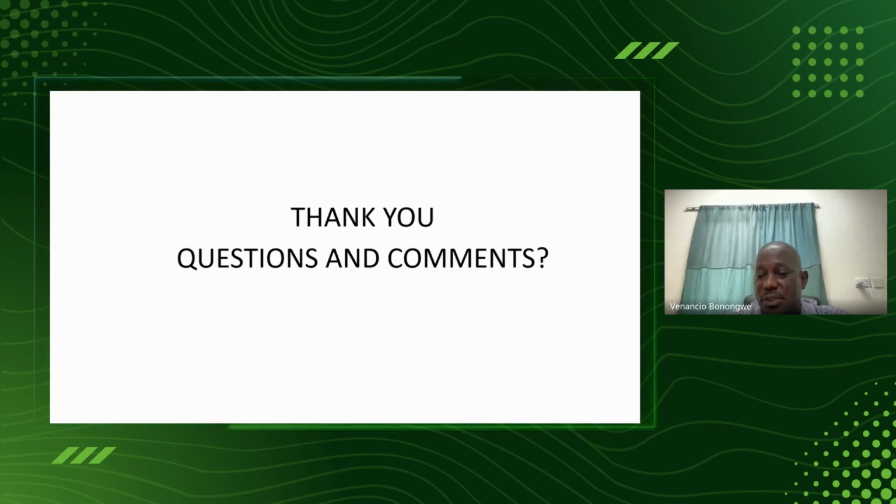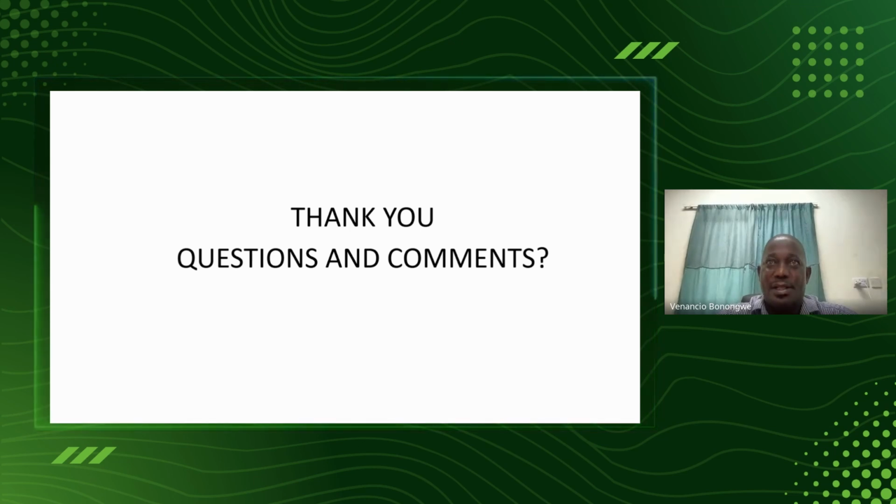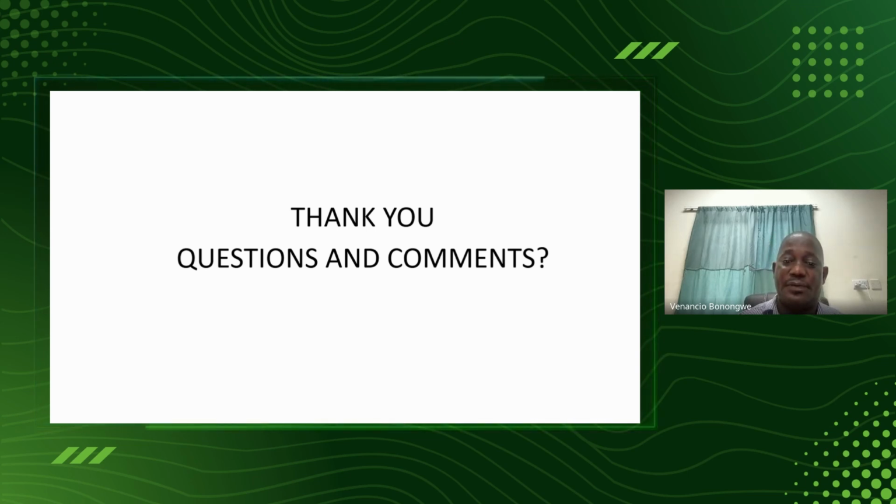About the other question, I think someone might help me, but for the calibration of safety valves, I think you can be checking it every year. That is annually. But if someone has another suggestion, another idea, please, you are free to add.